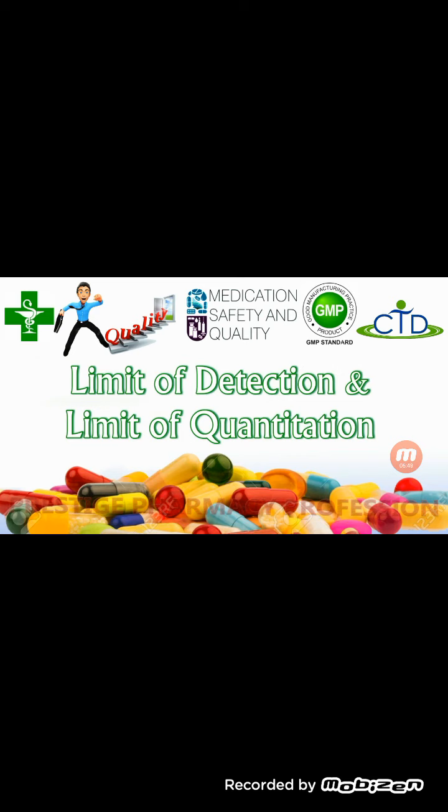Limit of detection and limit of quantitation are parameters to check the UV absorption response of the analyte at a minimum level from where it gives you a constant and authentic reading to move forward in selection of the analytical method.